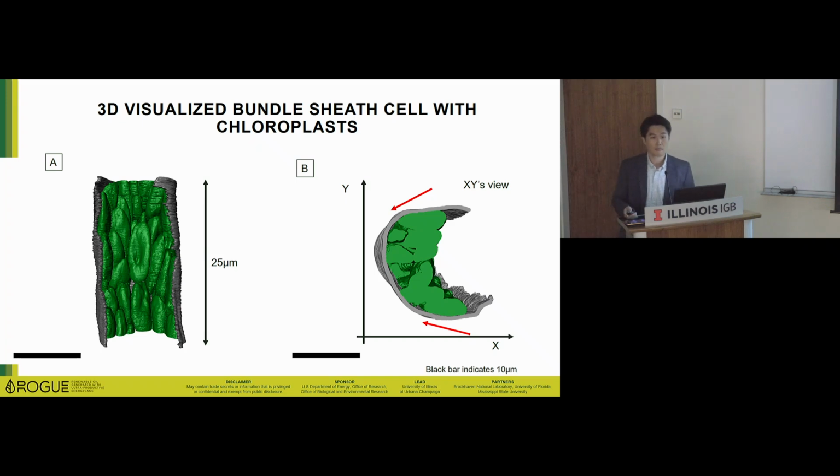Just a comment. I came from a metrology institute in another country, where the problem of cell counting is discussed. I think your work is amazing, but this is just a suggestion. When we discuss how to measure and count, you have to think about the size and that you're counting numbers. You were trying to count by different methods.